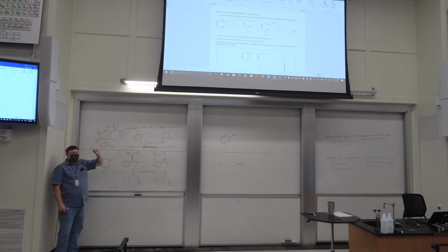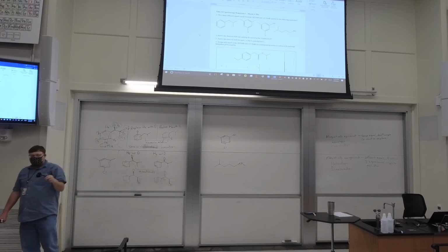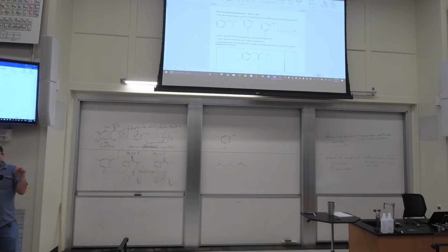Every carbon will show up in the C13 NMR. Every proton will show up in the proton NMR. And that's all that will show up. I think I said this in one of the PowerPoint shows. Spectroscopy is probably the part of organic chemistry that is the most broadly applicable to just doing science. Don't take more from the data than is there. And also don't invent stuff, right? If we thought it was this molecule and my spectrum has 8 signals in it, that's not the molecule. Or I've got to come up with a reason there's an 8th signal.